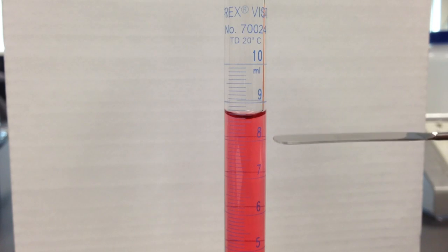So we know for certain that this liquid has a volume somewhere between 8.5 and 8.6. The last digit we record is our estimated digit, or uncertain digit.